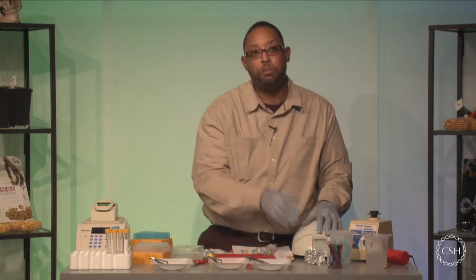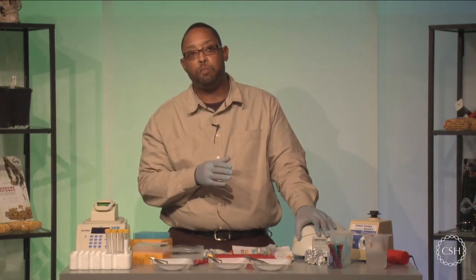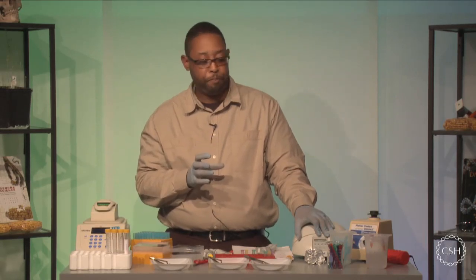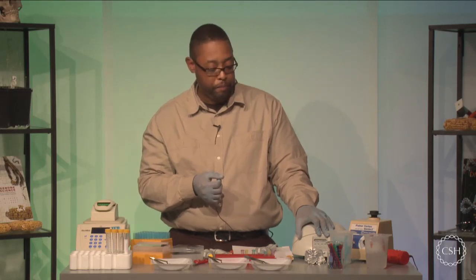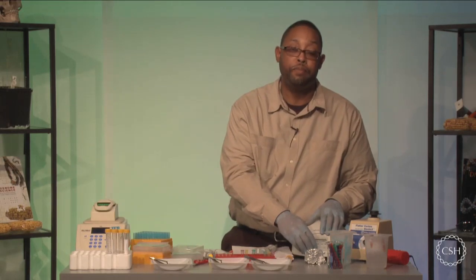This spin should be substantial so that you make sure that you've pelleted as much of the silica resin as possible, because you do not want to carry this over into your final DNA prep, because the PCR reaction is going to have a problem. So you want to make sure that you've spun this down for at least 1 minute at the highest speed that you can get, at least over 8,000 RPM. And this will ensure that all the silica resin is at the bottom of the test tube.